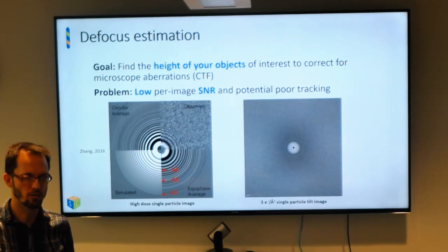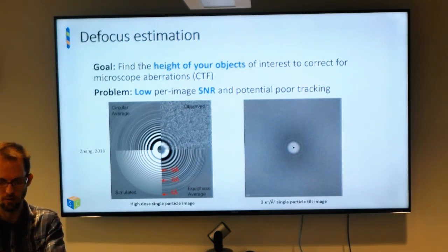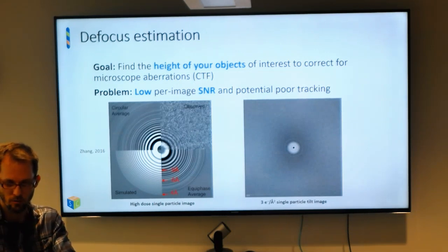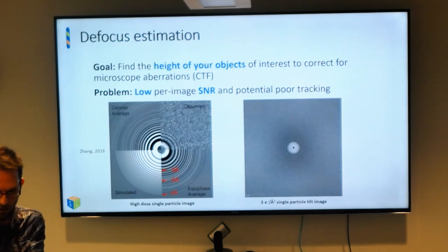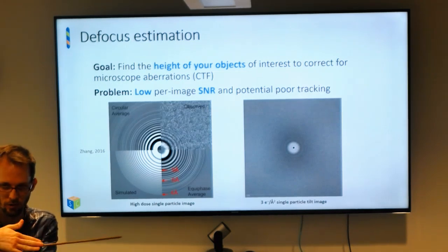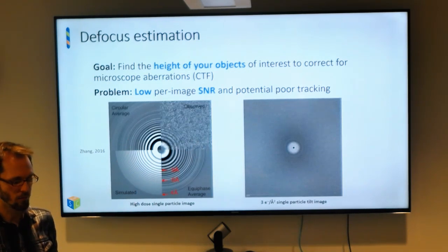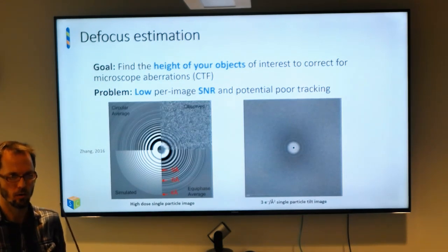Somebody has done a real test of dual tilt series alignment, where you collect on one axis of your sample, and then you physically rotate your sample 90 degrees, so now your tilt axis is different. You collect here first, and then you rotate it entirely like that, and then you get these angles right here. It gets you better 3D reconstruction. Somebody has done Tomo versus fiducials there, and Tomo does better, but it does better because of the order in which it aligns things.